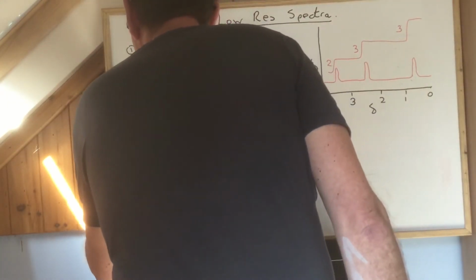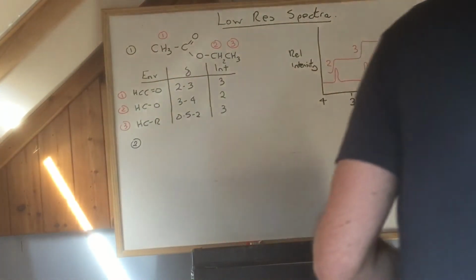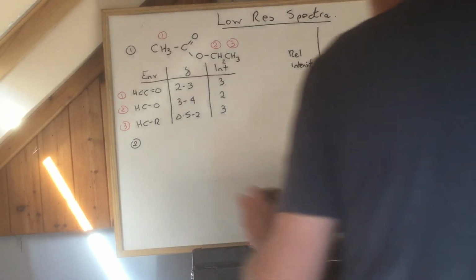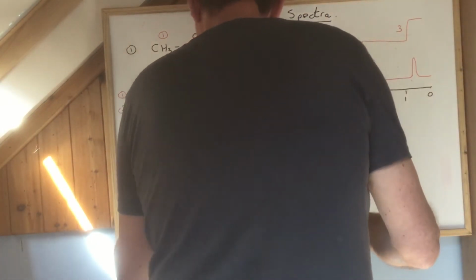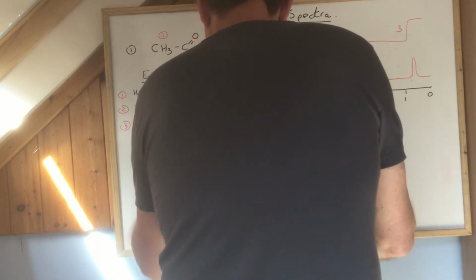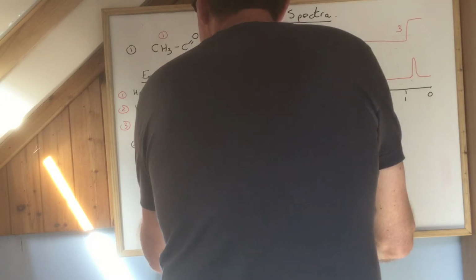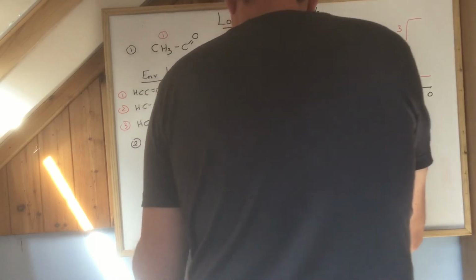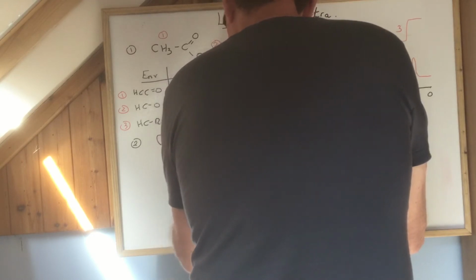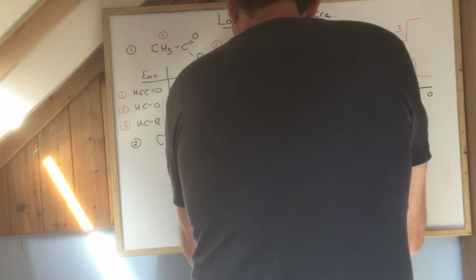Number 2. Right. Next one. Same idea. C, H, 3, C, H, 2. Again, very similar to the one above. An ester linkage, CH3.